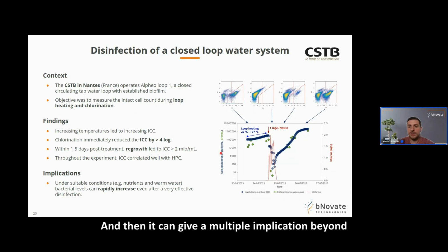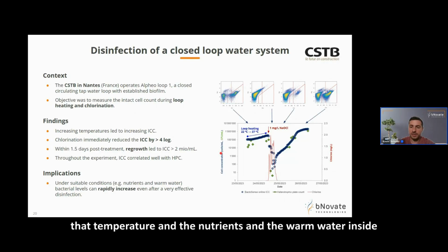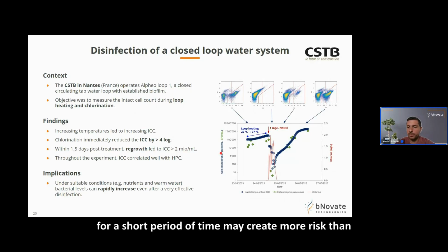And then there are multiple implications beyond that. Of course, as we already know, temperature, nutrients and warm water inside the system can lead to more bacteria and more risk. And the shocking effect is that disinfection for just a short period of time may create more risk than it removes, as you will create in the end more bacteria over time.